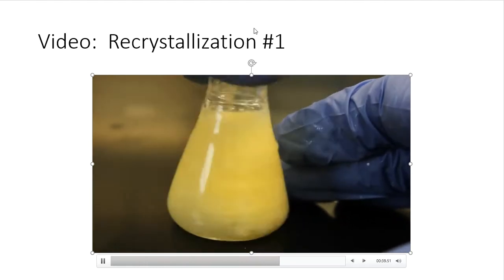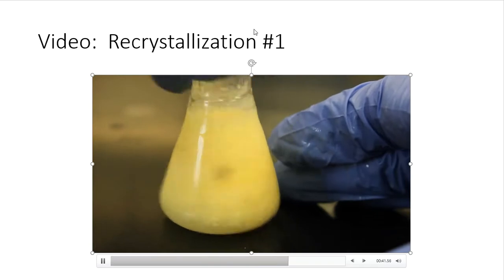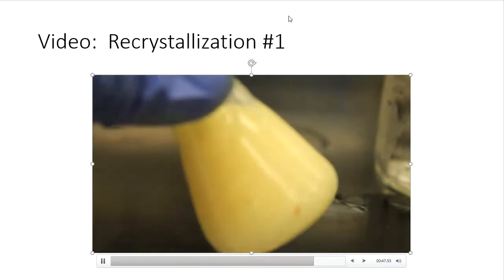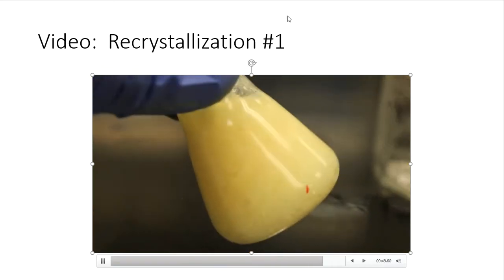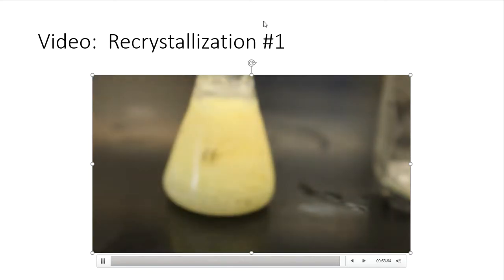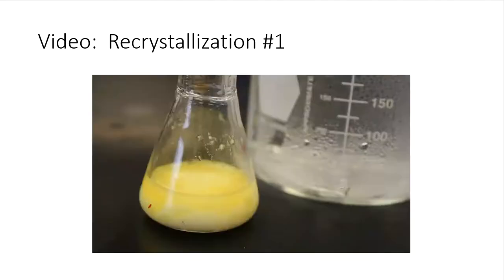And now I think that you can fully see the crystals that have formed in that flask at this point. There they are, just in case you need observations for a question. All right, so I'm going to do number 2 the same way.